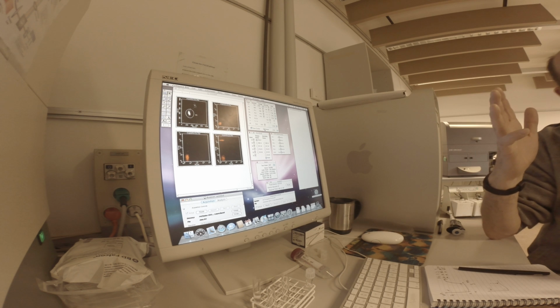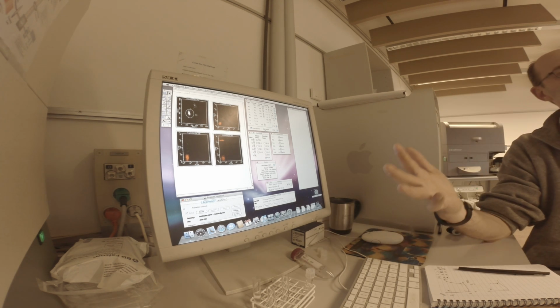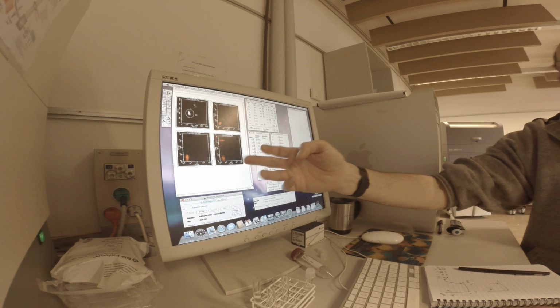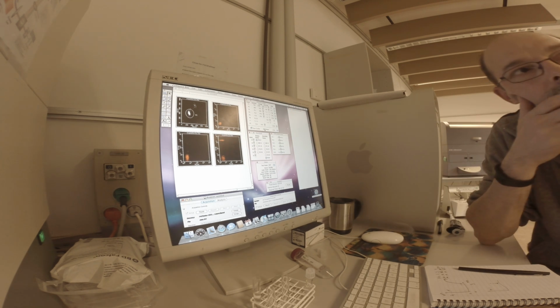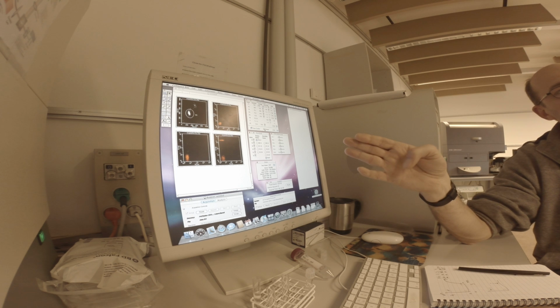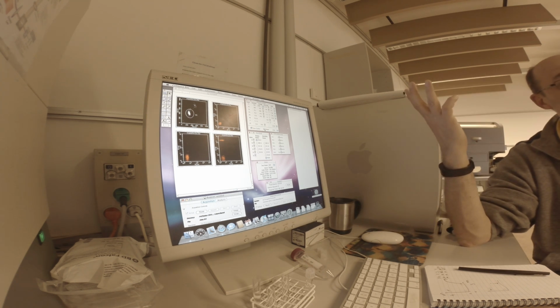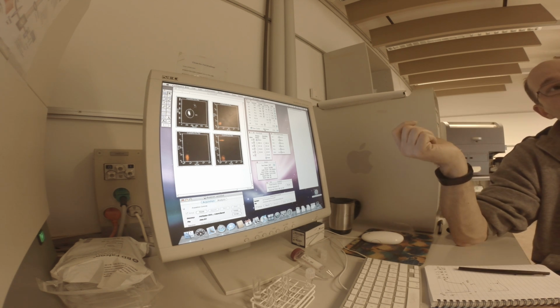Because there will be a limit where it's so way off that they can see this is not working. But small, subtle differences, they barely can see it here, but it will reflect in the numbers. That's right. And there is a little bit of random, and that just reflects every user that comes down here. I can ask my technicians to set it up, the three of us, and we won't hit the same number. And we can't agree on one being more right than the other.